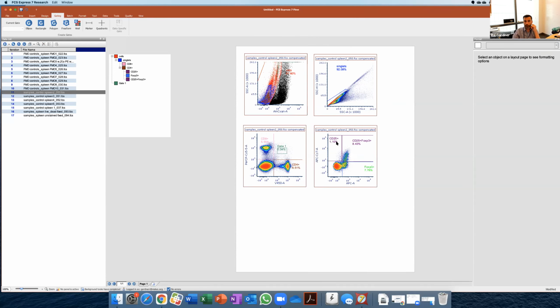Okay. There's also another question that came through from Aman asking about, when we're using FMOs, does the intensity of the fluorochrome matter? Should they use a strong color like PE? I think they're wondering if you should only use FMOs based on the intensity of the fluorochrome. No, it depends on the levels of expression also. You can have a very bright fluorochrome, and usually it is important to use a bright fluorochrome when you have antigens that are low expressed. But on the other hand, it may not pull out entirely.